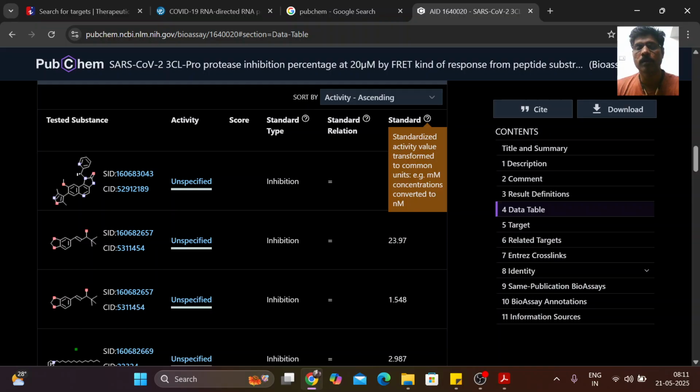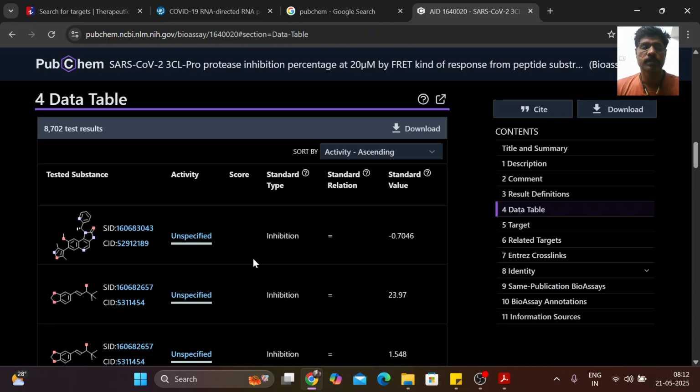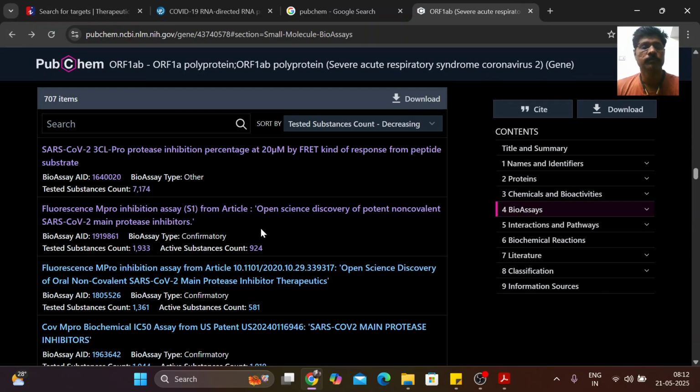Converted into nanomolar. Actually, here there is no detailed value, so I will skip this. I will check with another one.